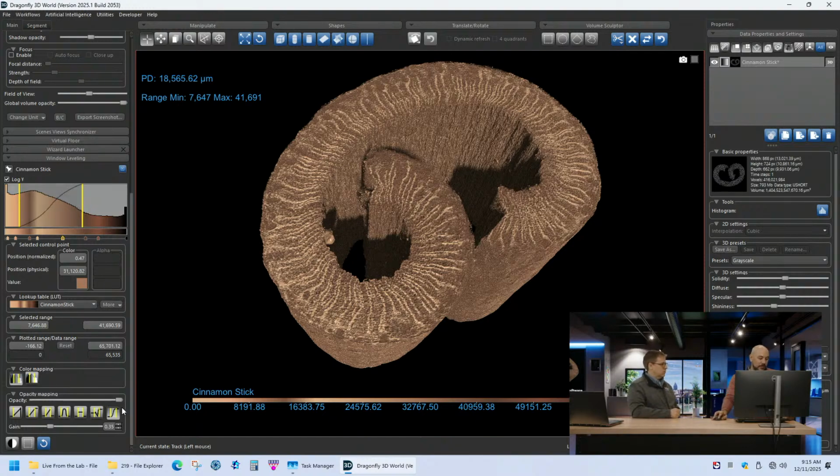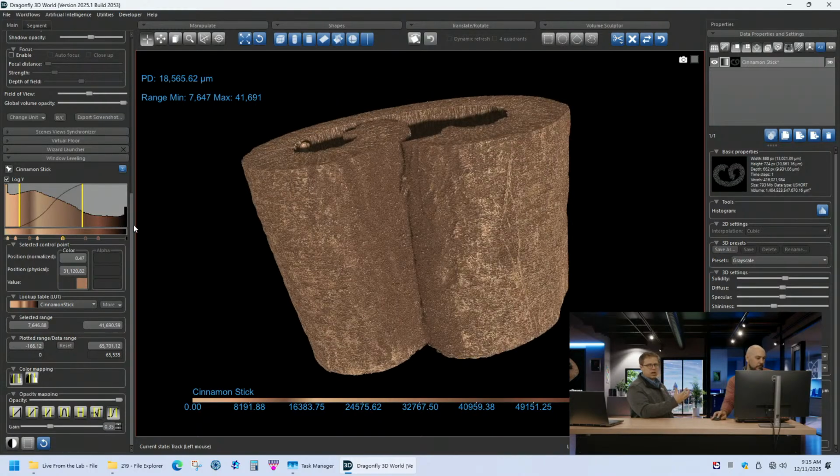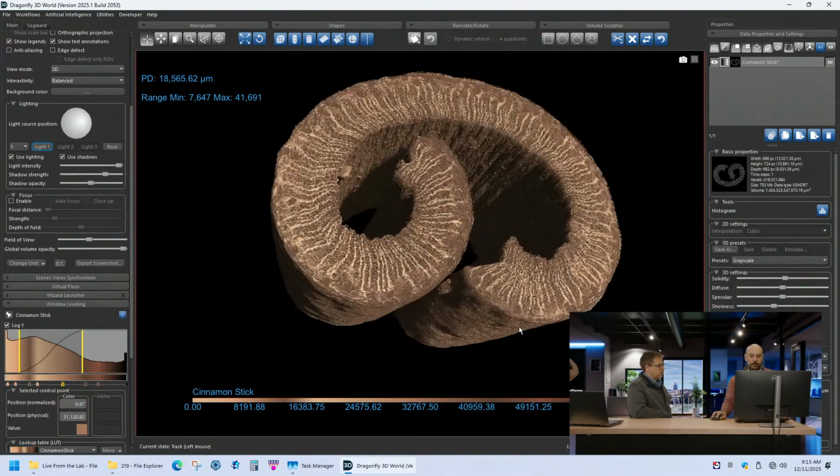And there are all these different functions down here that you can mess with. Basically, it's see what works best for you. Right, every data set's different. You might use a different function every time. Yeah, and so what we're trying to do here is clearly differentiate the features that we want to look a little bit deeper into. Right, we want to communicate about.